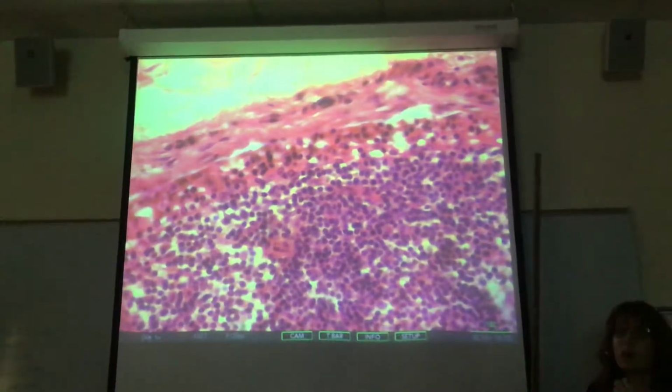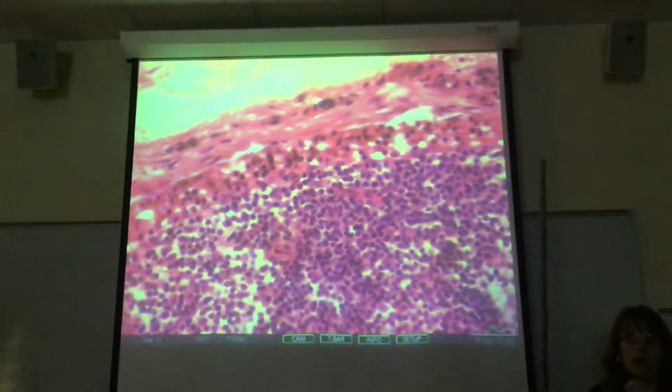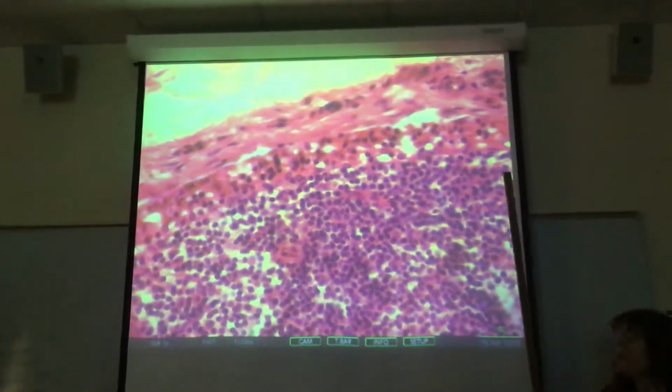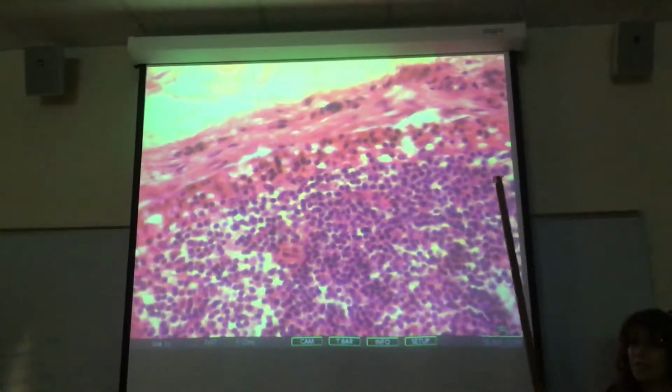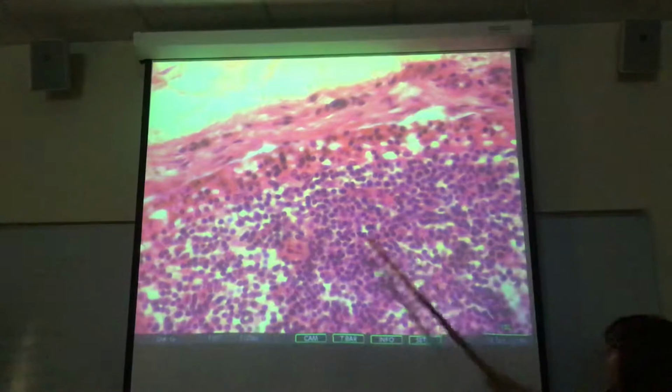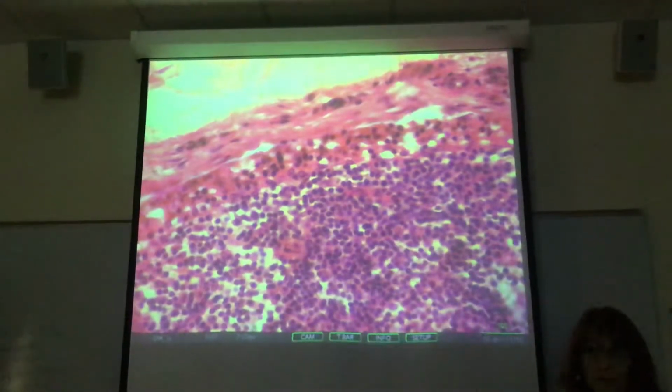Okay, so that has implications about how big they can grow. Your tonsils can get quite big, as you saw in the video, even closing off your pharynx, right? And the lymph nodes can swell, but only to a certain size because they've got that capsule. Okay, so make sure you look at that high power so you can see beautifully those lymphocytes.